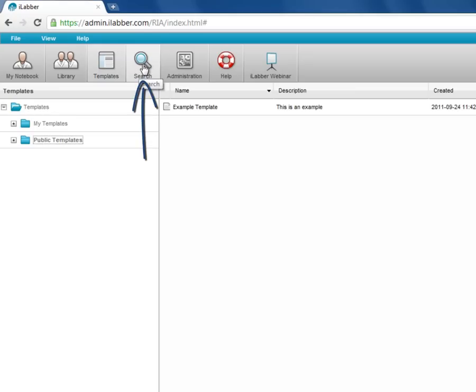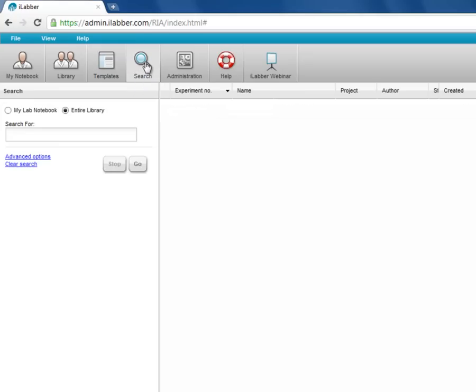The fourth button is the search button. This is where you can come and search for experiments, either in all of the notebooks which you have access to, or just in your own lab notebook. You can use a simple text Google-like search, or click here to go to the advanced options.